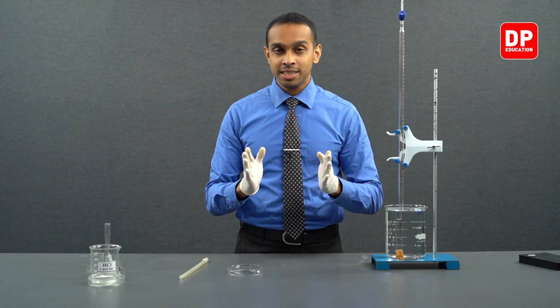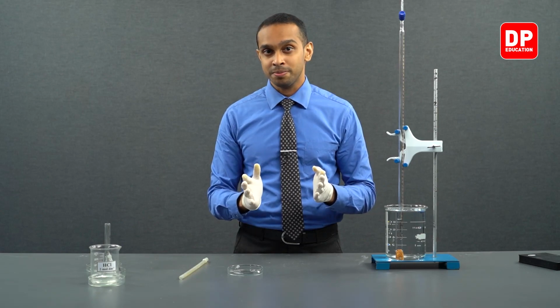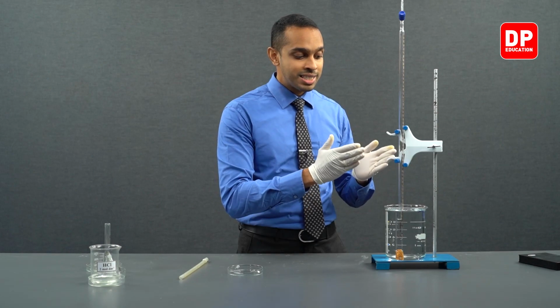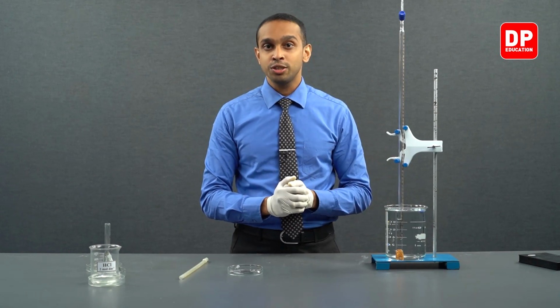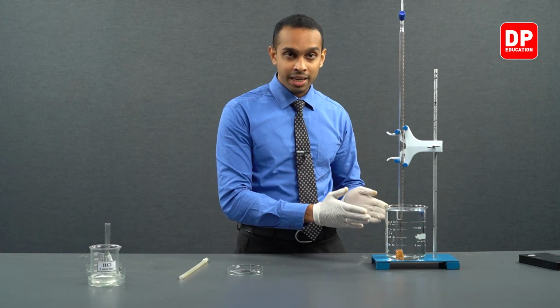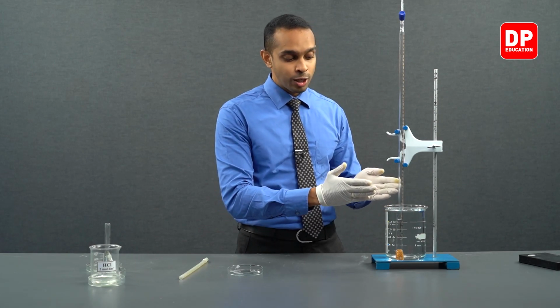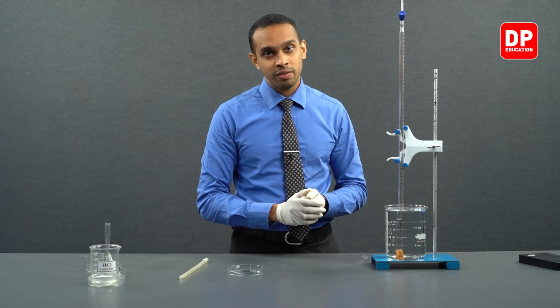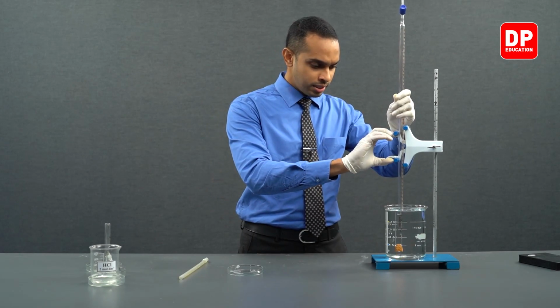However, this hydrogen gas is not at the atmospheric pressure. For it to be at atmospheric pressure, the water level inside the burette and the water level outside the burette should be equal to one another. So, the reading that we take here is not entirely correct. We have to first make sure the water level inside the burette is equal to the water level outside the burette. Let's go ahead and do that.